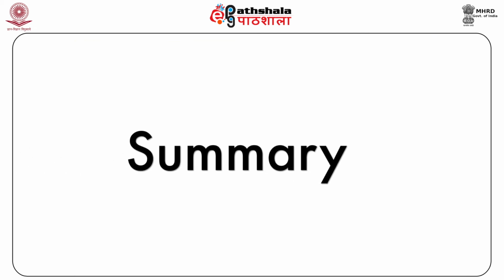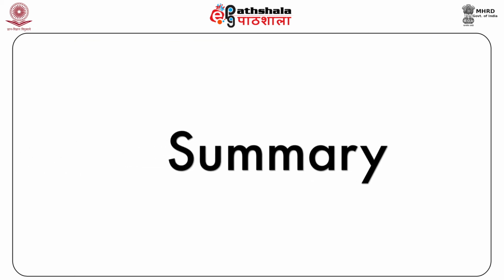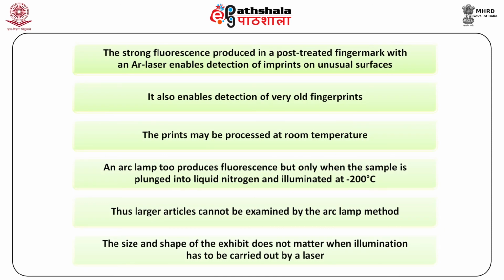Dear students, now let us summarize this chapter. So, in this chapter, we have learned that the strong fluorescence produced in a post-treated finger mark with an argon laser enables detection of imprints on unusual surfaces. It also enables detection of very old fingerprints. The prints may be processed at room temperature.